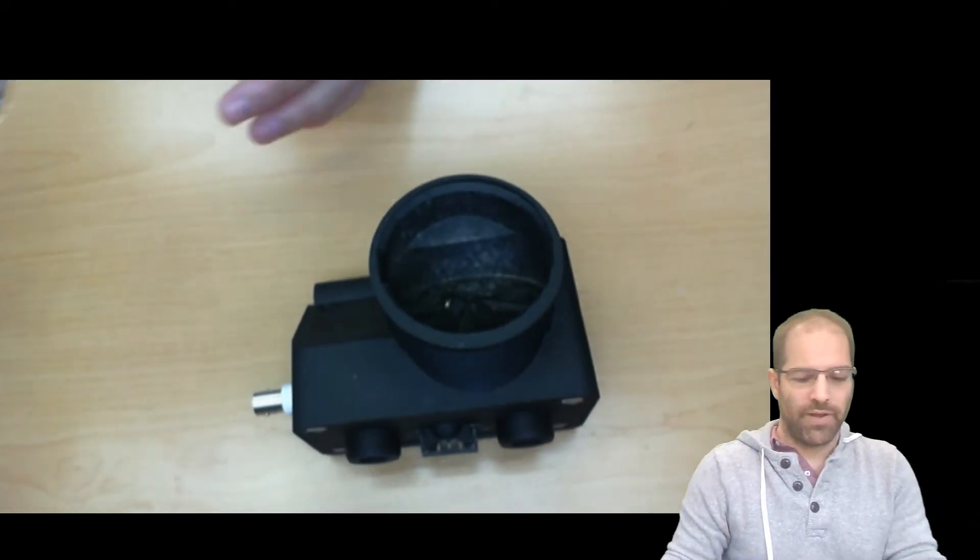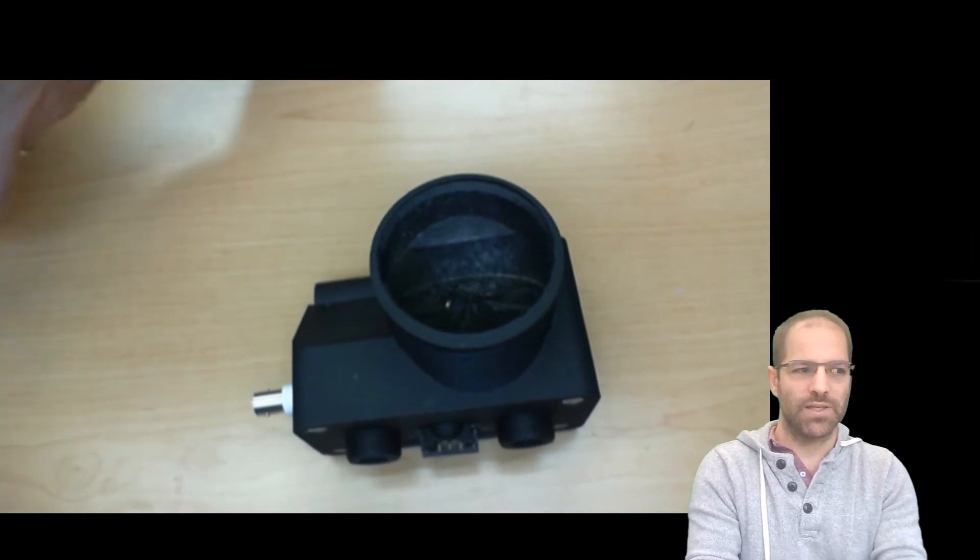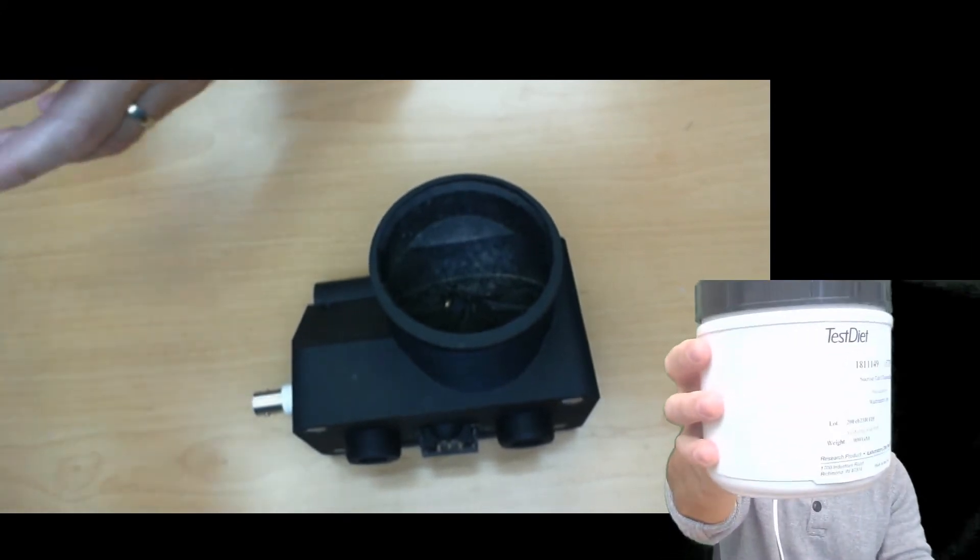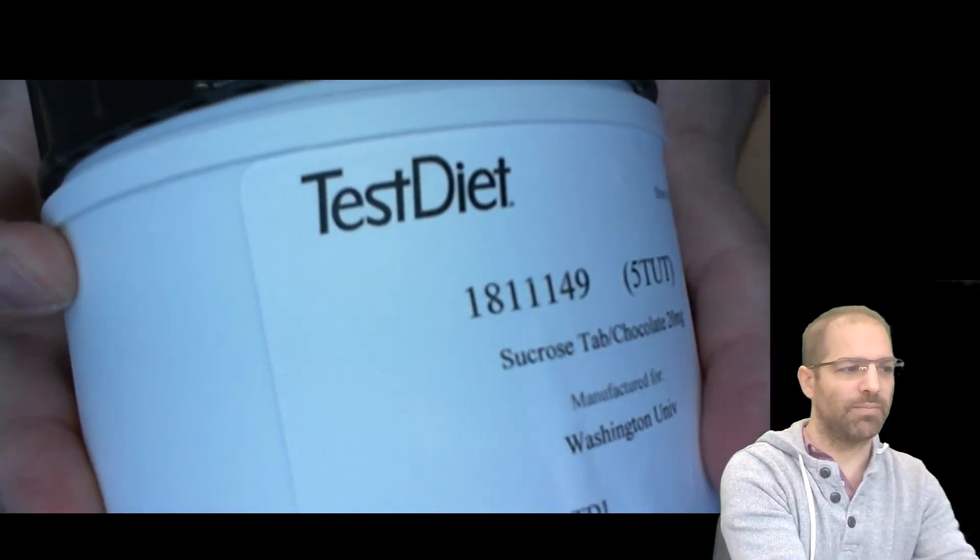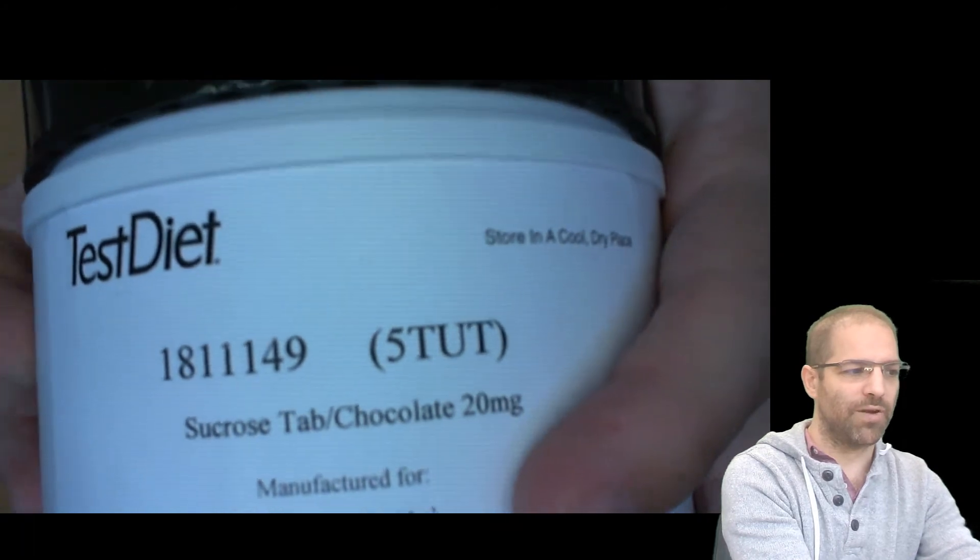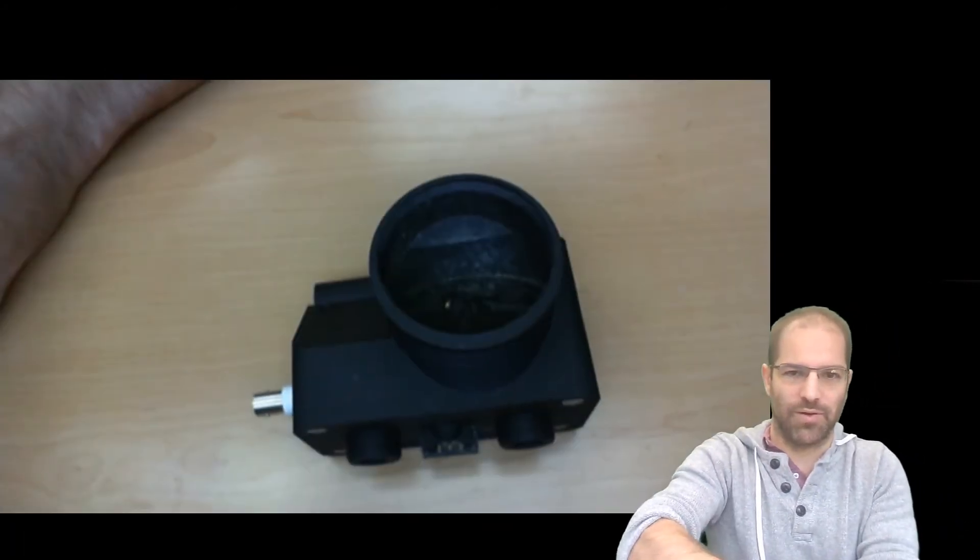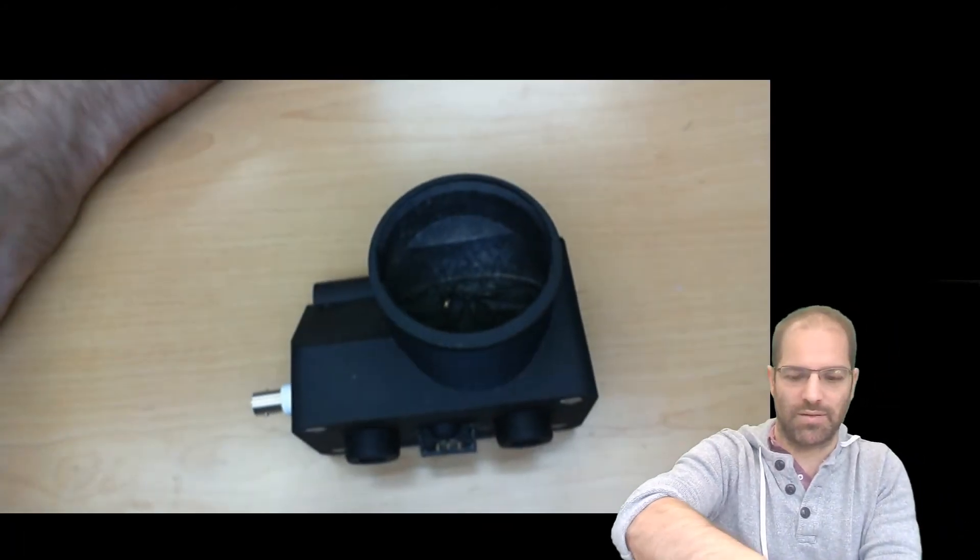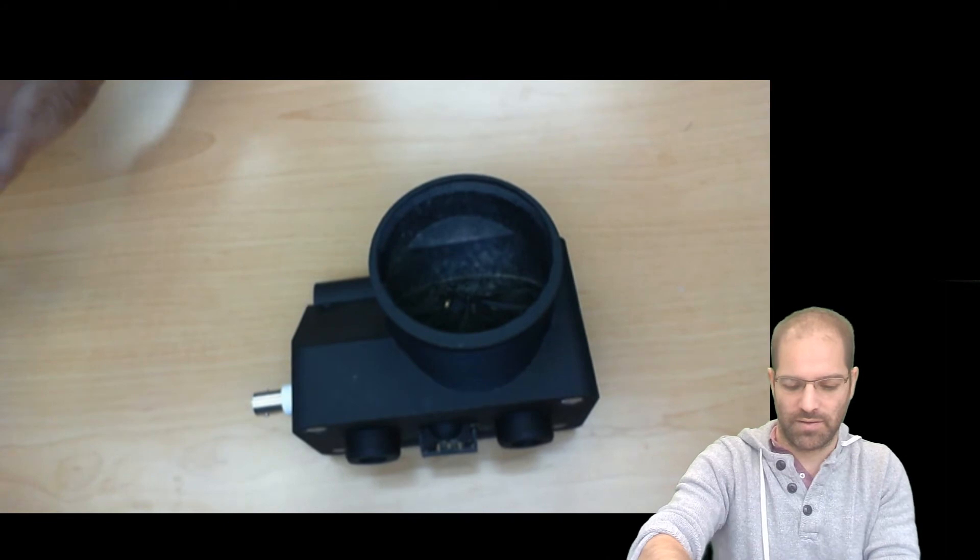To fill FED3 up with pellets, we use these pellets from Test Diet. They're 20-milligram pellets, either in sucrose or in grain formulations.